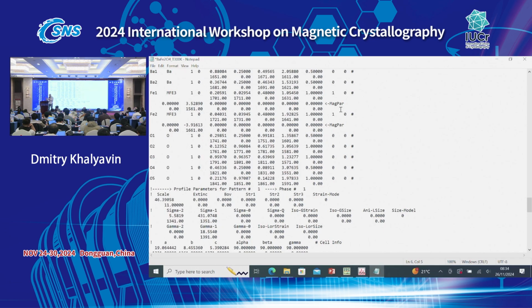Choose one which contains all the peaks you have, let's say bank 29 for magnetism. In your case, I think it was bank 29 which contains all the magnetic peaks. Then use only this bank in the refinement of the magnetic structure. You will have more chances to model absorption correctly and get a meaningful size of your europium moment.